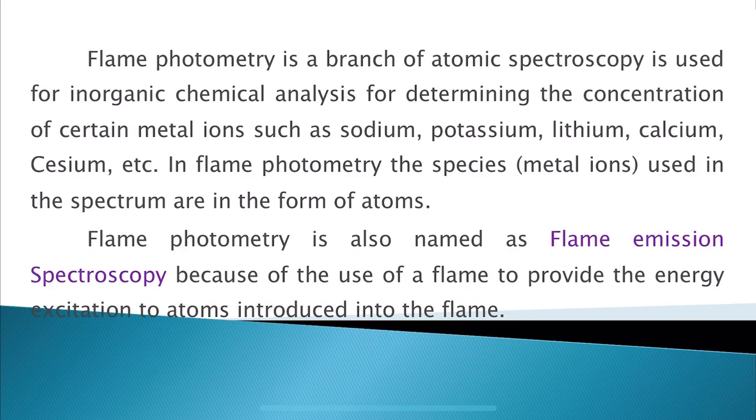The concentration of these metal ions is easily determined with the help of flame photometry.